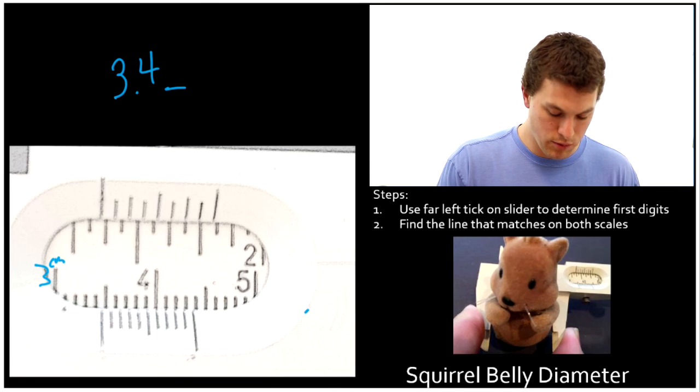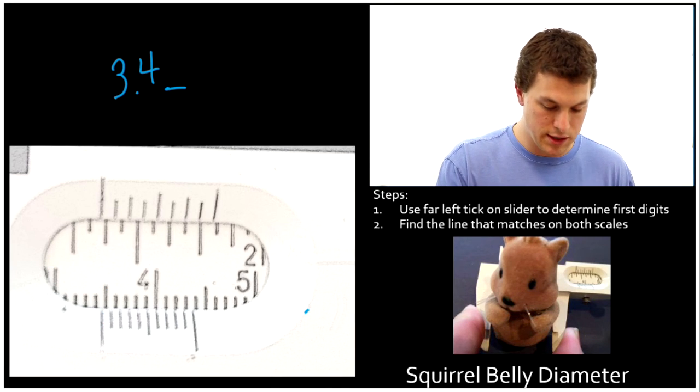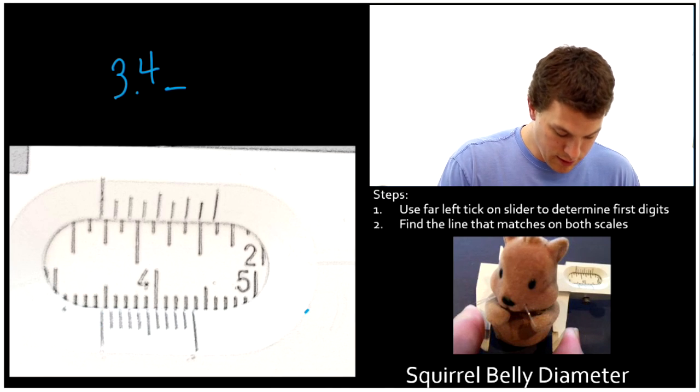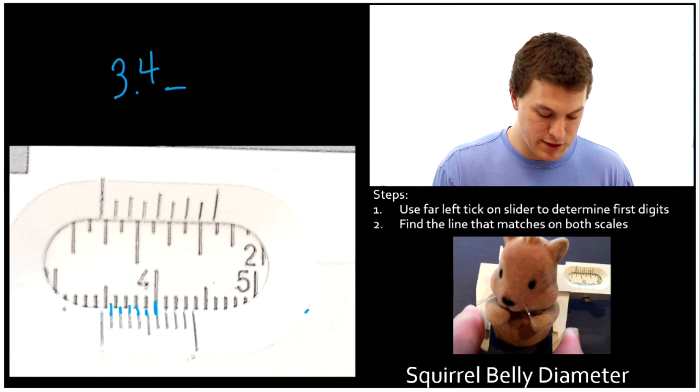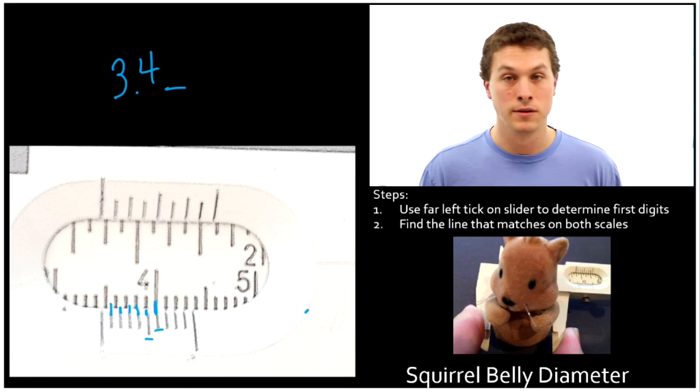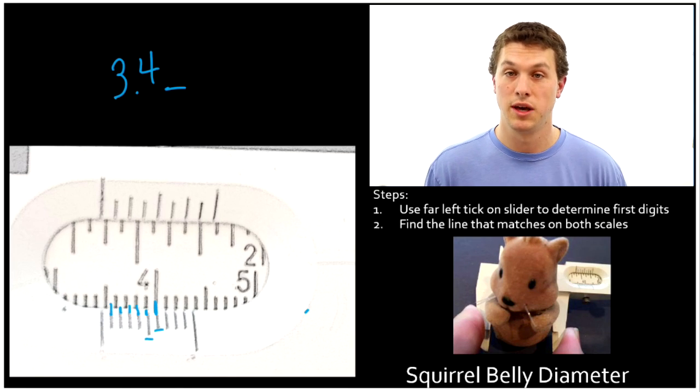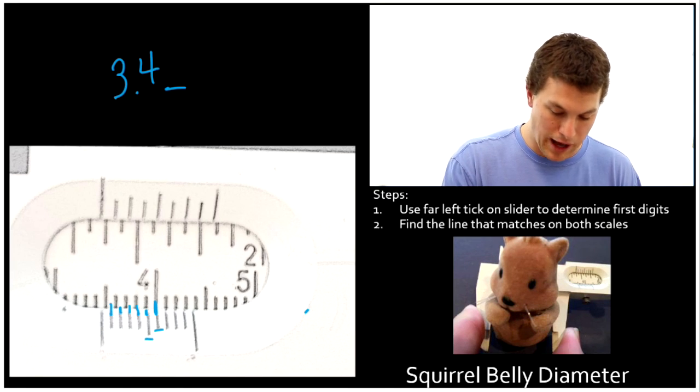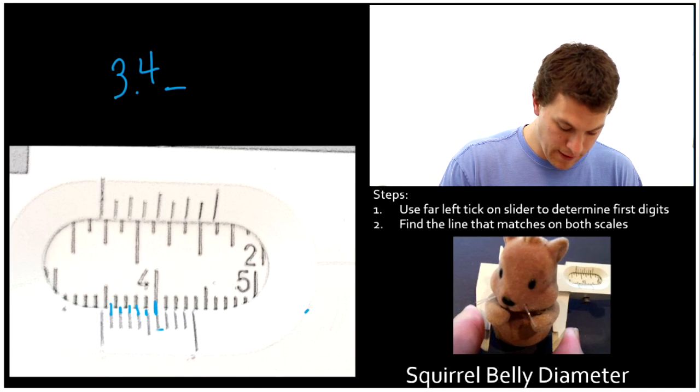How do we do that? That's step two where we look and we see what digits line up exactly. That one certainly doesn't line up, doesn't line up, doesn't line up. Getting closer. That one looks close. That one looks pretty much spot on. And again here you could see like maybe you could select that one or that one. So some people will disagree when they read these, but you should get pretty close to the same answer. So I'm going to take this one as being the one that lines up right here.